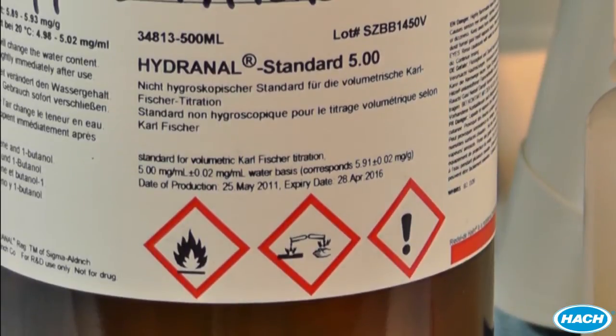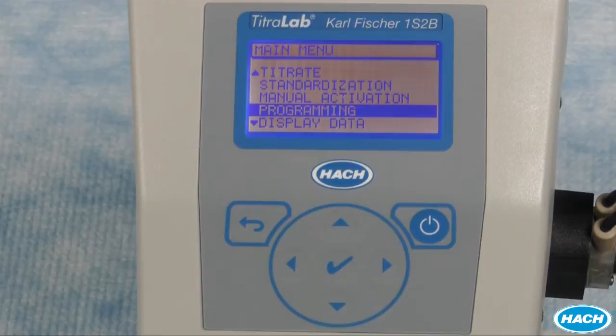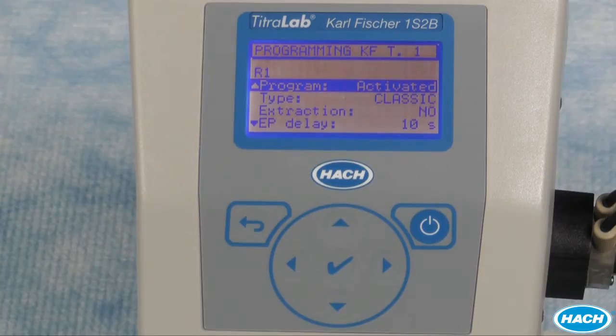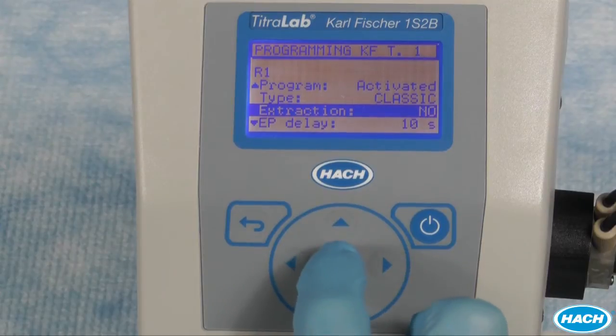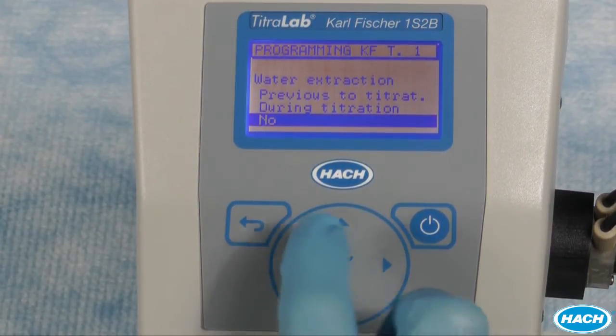We are going to use a five milligram per milliliter water standard for our calibration and verification. This is a volumetric sample that we will add with a pipette. Before we begin our analysis, we need to make sure the programming is set up properly by scrolling to the programming menu and pressing the check mark. Then scroll to P1KF Standard to program our analysis for verification using the five milligram per milliliter standard. Select Activate so the program will show up in the start menu. Select Classic for our solvent and titrant. Extraction is a feature that allows more time for mixing and extracting water from samples that may have difficulty releasing their water molecules during titration. Since our water standard is in a matrix of methanol, we will select No for extraction.